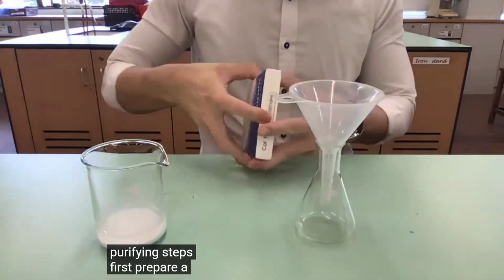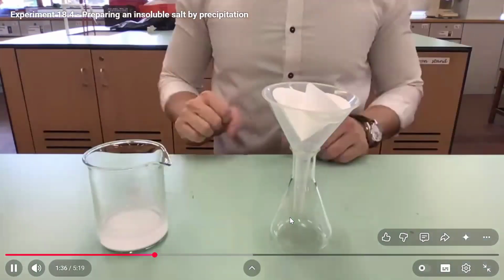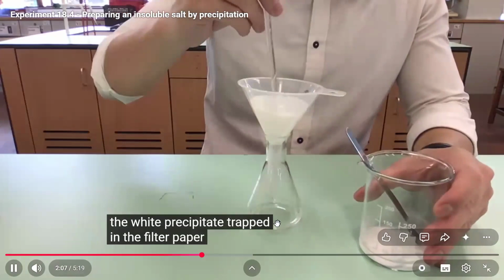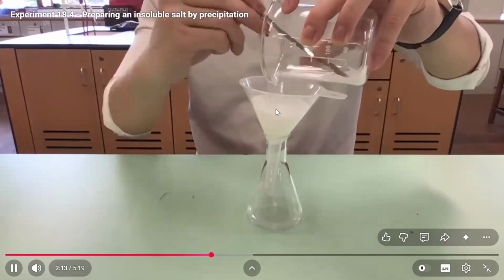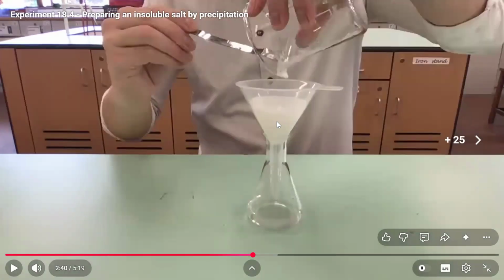First, the filtration setup. इसमें भी sodium nitrate है, lead sulfate है, ठीक है। So they're just going to filter the solution, right? ठीक है, हमने फिल्टर कर लिया। अब देखो, in the filtrate we'll get sodium nitrate, ठीक है, and the residue or the insoluble salt will be there as a residue, ठीक है। अब the next step is going to be, you have to wash the residue, and how you're going to make sure that all of the precipitates are transferred into the filter paper.